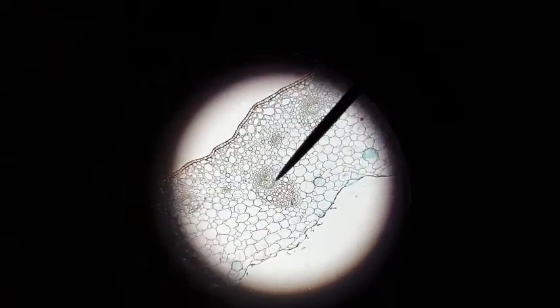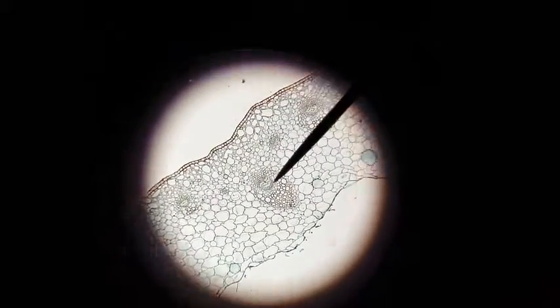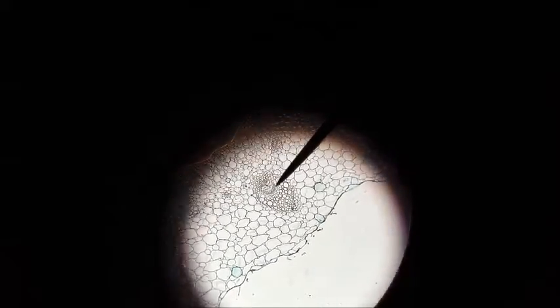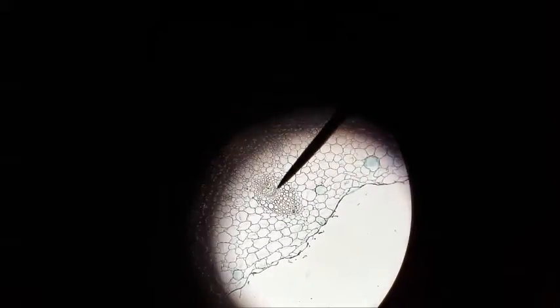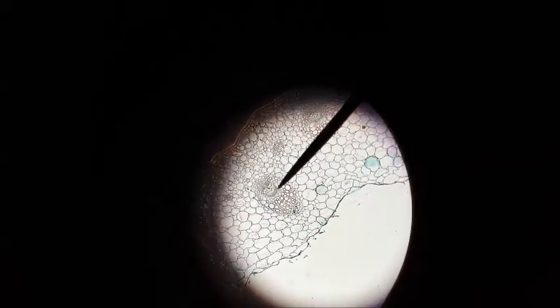On 100x magnification of the dicot stem, I have the pointer on a U-shaped area which I believe is the phloem. Just immediately above and to the left would be sclerenchyma, and then immediately to the bottom right in this little island would be the xylem.